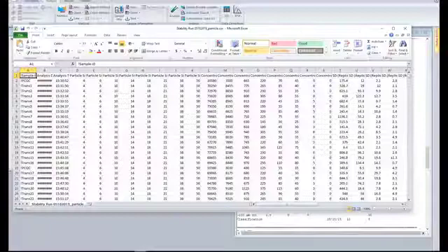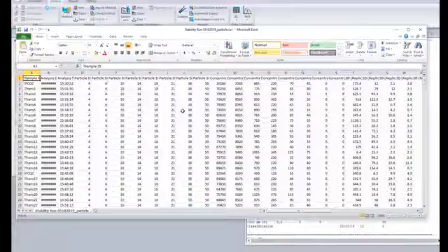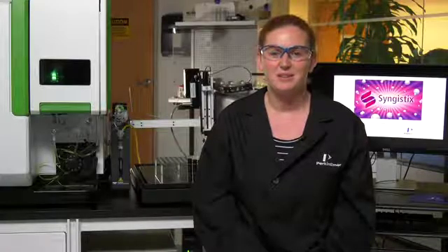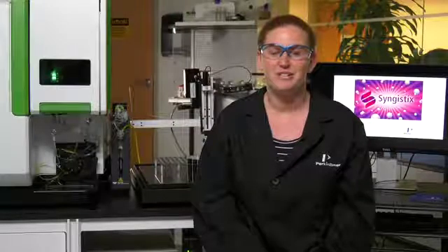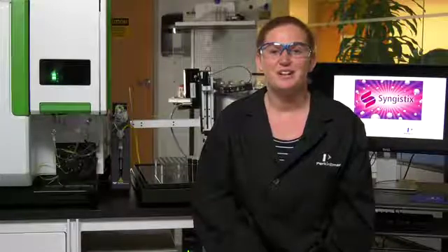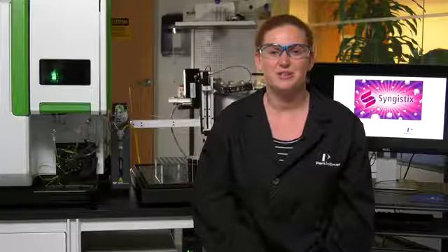Here is an example export provided by the system ready to be uploaded into your LIMS. Perkin Elmer's LPC-500 is the smallest automated particle counter available in the lubricant and oils analysis market. It uses less than one milliliter of lubricant sample and offers extremely fast sample-to-sample analysis time compared to commonly used platforms in this industry. And when coupled to an Avio 500 ICP OES, this integrated solution provides wear metals and particle count analysis in a single run, optimizing your laboratory's operating costs.